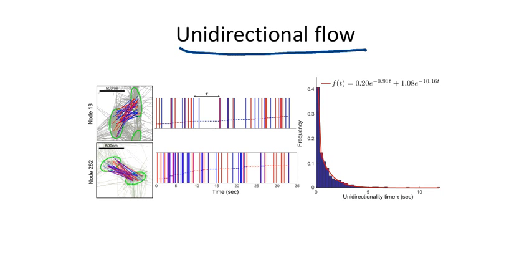If we start, let's say, this is A and this is node B, it is quite unclear what is the mechanism that would allow trajectories to go only from A to B, as we can see here, and then here, those are going from B to A. However, again, these features could be found in most of the nodes that we looked at, suggesting that there is a mechanism by which the flow is temporarily unidirectional before switching to the other direction.